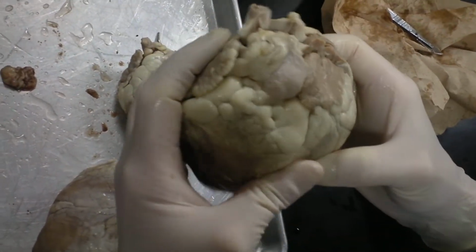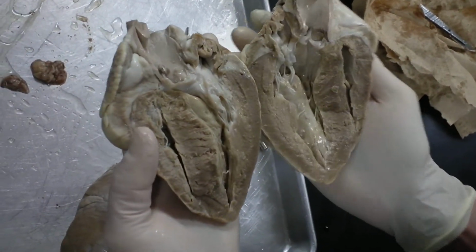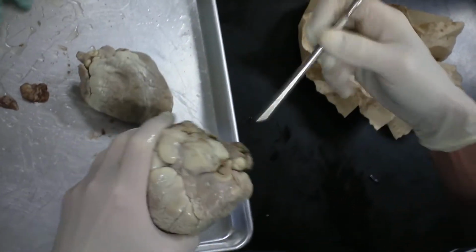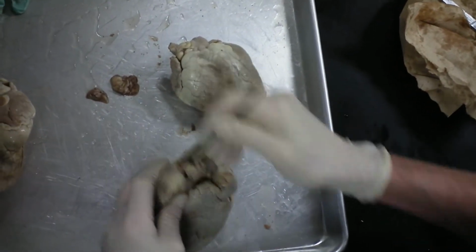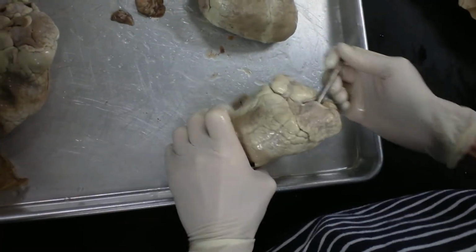What heart was it? I don't think this was the good one. There's one that was really good. I think it was this one. You can feel the probe. It's in this chamber, which is called the right atrium. The blood dumps into the right atrium from the superior and inferior vena cava.